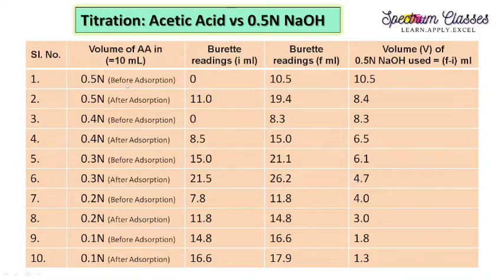Before adsorption is what we prepare, and after adsorption is taking 50 ml of this, I have added it into the reagent bottle which is having 1 gram of activated charcoal in it, and after leaving it for 30 minutes, and in between we are shaking the bottles occasionally, after 30 minutes I will filter it out, and that filtrate is termed as after adsorption.